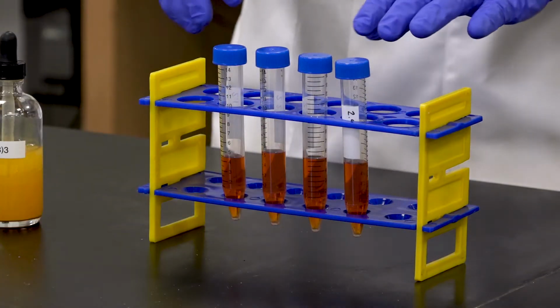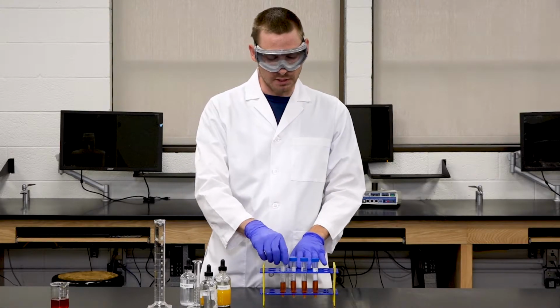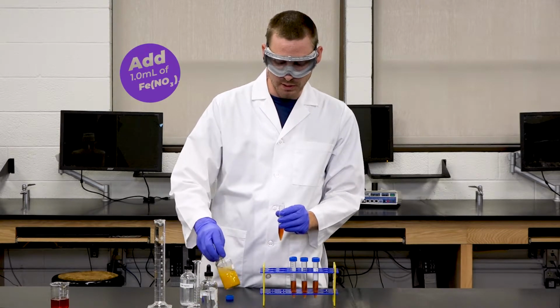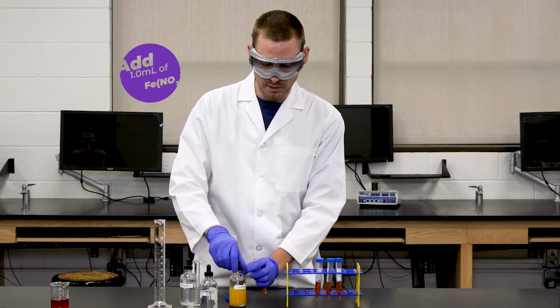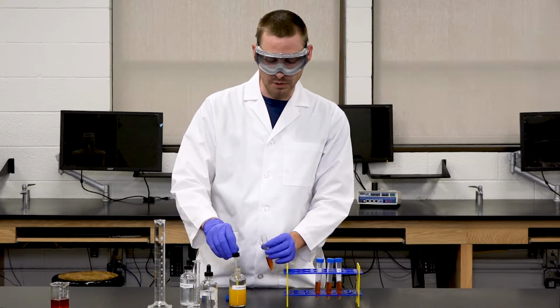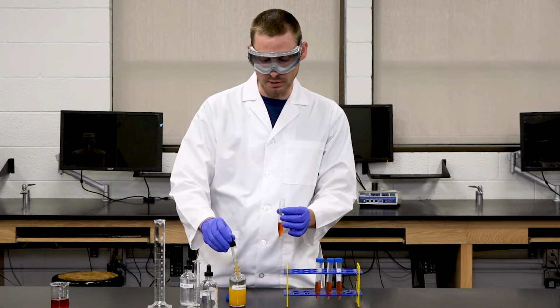So now we're going to add some reactants to these mixtures here, and we'll see what the color changes look like as we do so. So first we're going to add 1 milliliter of iron nitrate to the first test tube. We'll add 1 milliliter with the dropper, which is about 25 drops, or you can use the gradations on the test tube or a graduated cylinder.